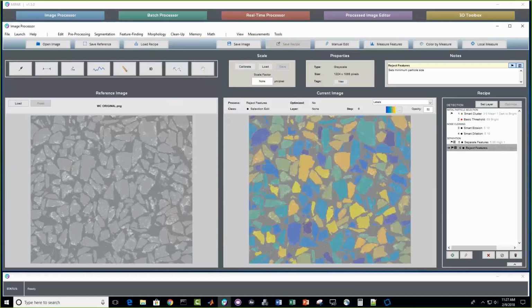So that's the first recipe we wanted to start with, a pretty basic one, but even though MIPAR is very good at the problems that others have trouble with, it of course excels at the simple ones and allows you to tackle the simpler problems more efficiently as well. Simple porosity finding or other particle detection and measurements are also made very efficient given MIPAR's interface.